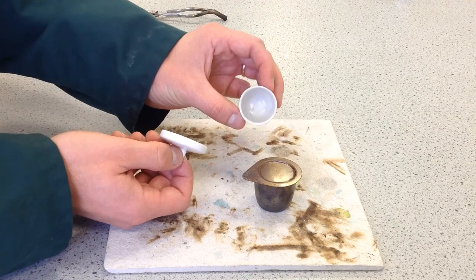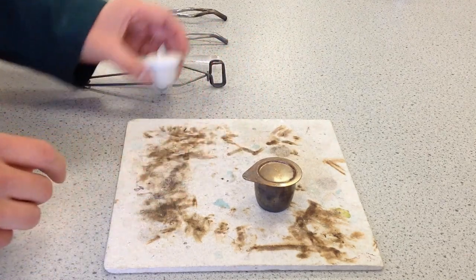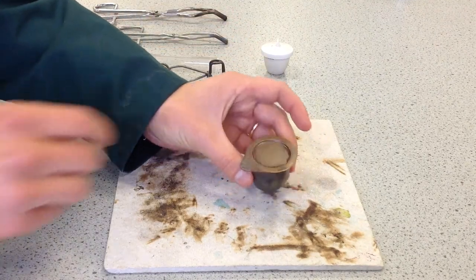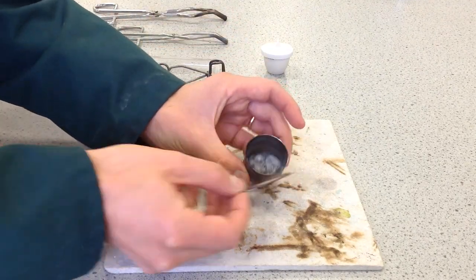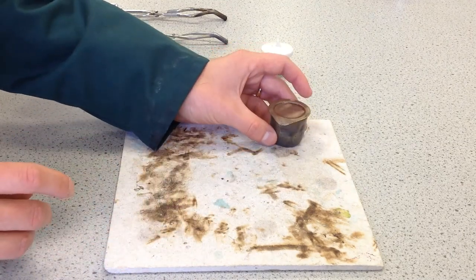It comes with a lid, and this would be where you'd put your sample. In recent years, we've invested in stainless steel crucibles, which are much more durable. They also come with a lid, and they're a little bit larger. But you can get crucibles in all sorts of different sizes.